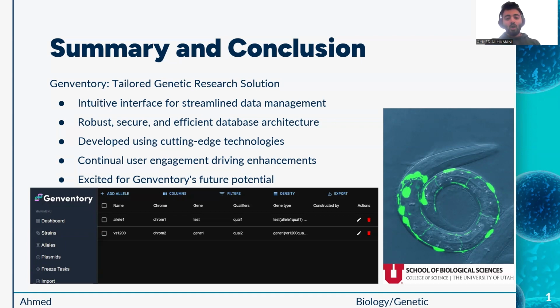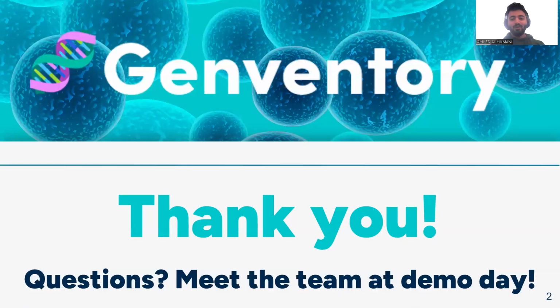As we conclude, we are excited about Genventory's future potential and the impact it can make in the field of genetic research. We would like to express our sincere gratitude to Jurgensen's lab for their invaluable insights and collaboration throughout this journey. With Genventory, we look forward to further revolutionizing genetic research.